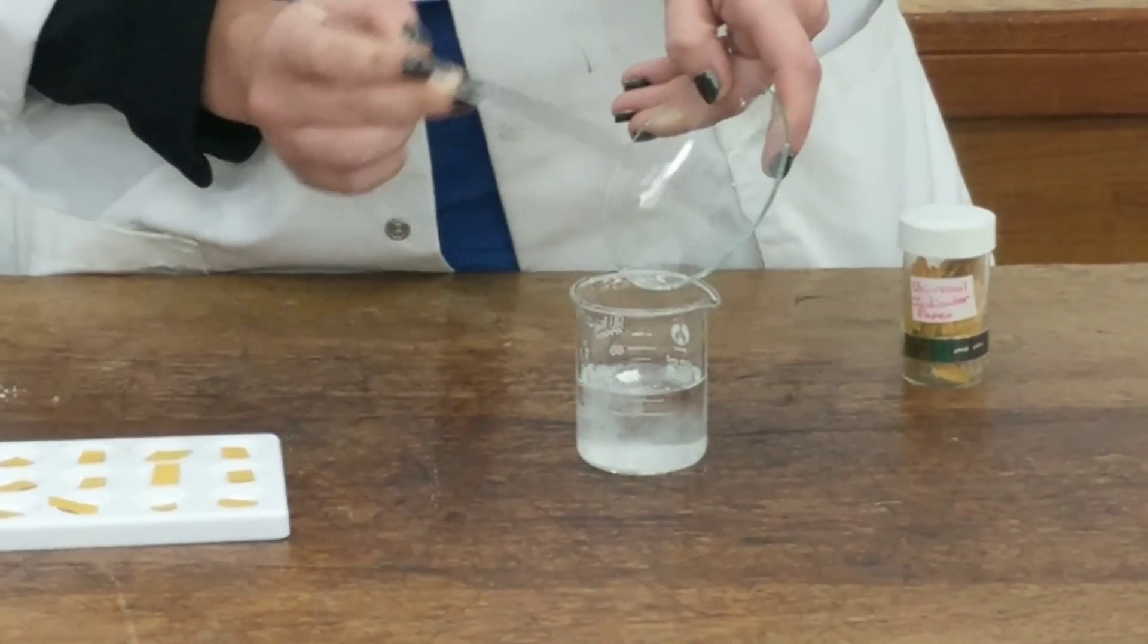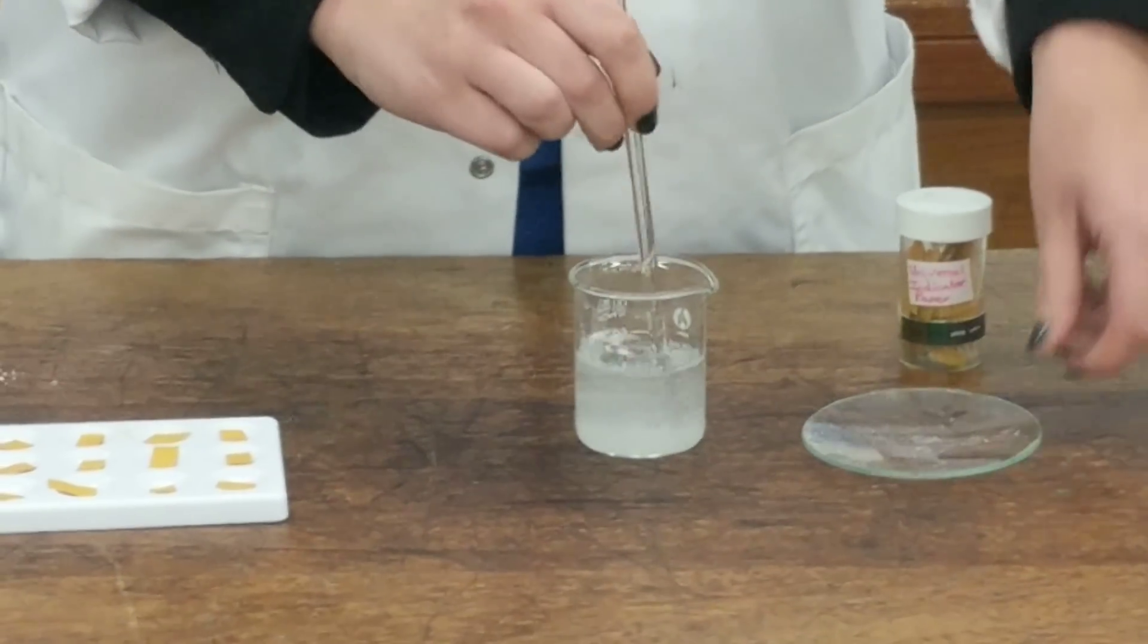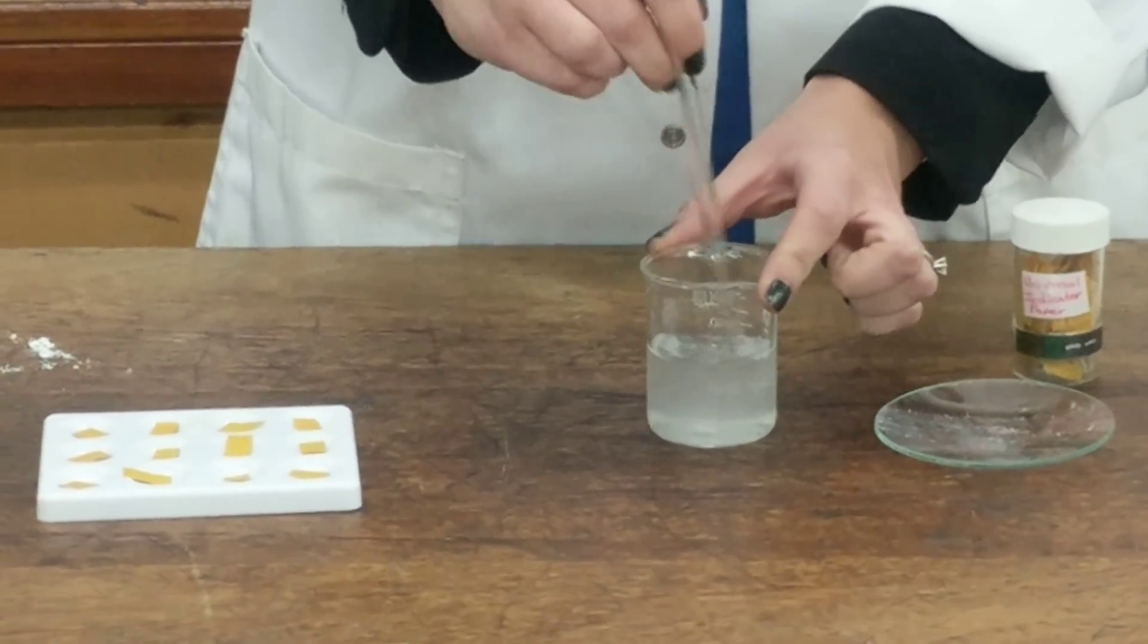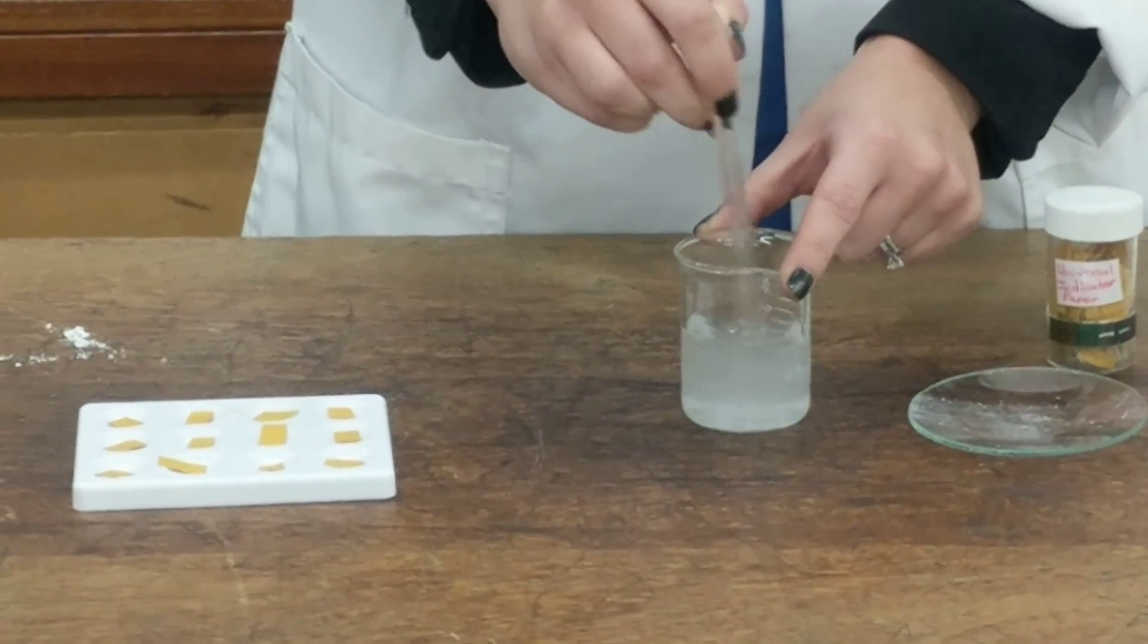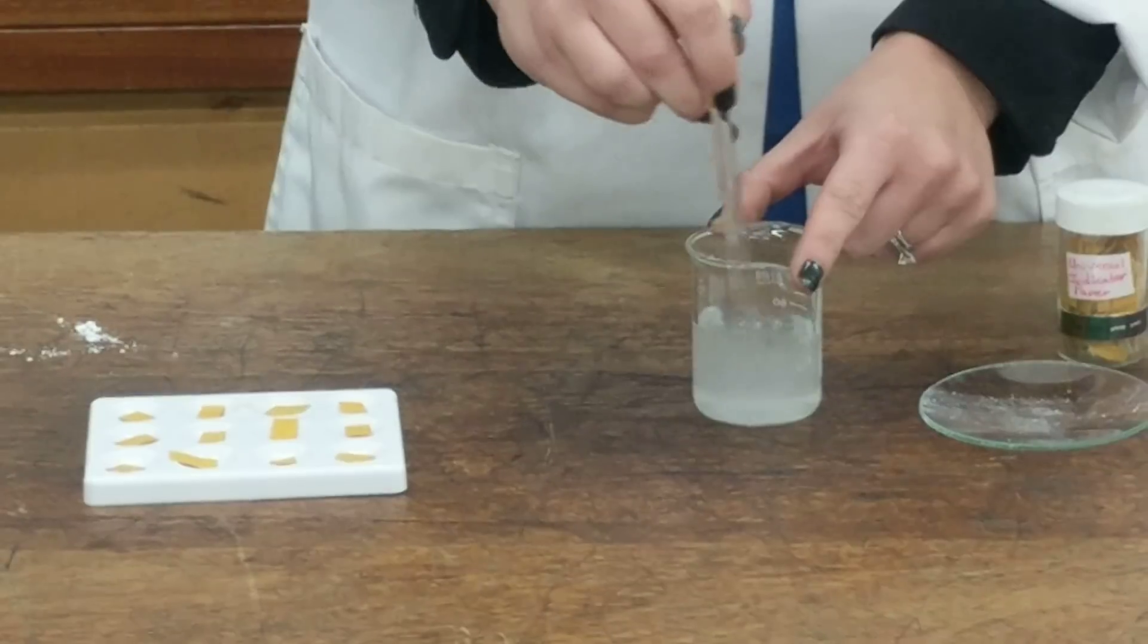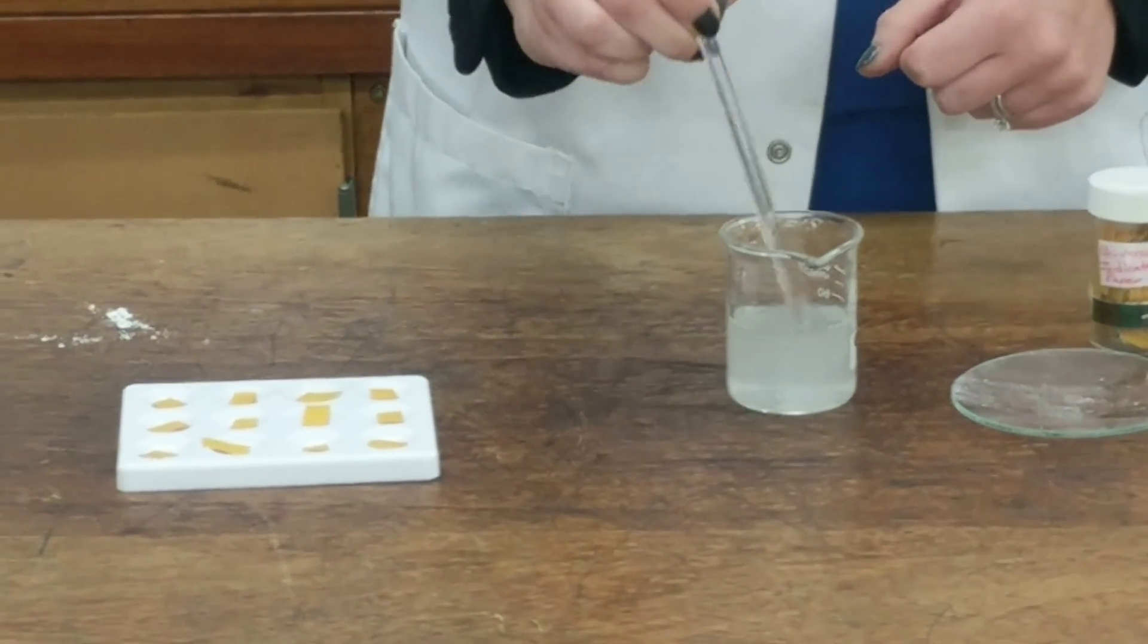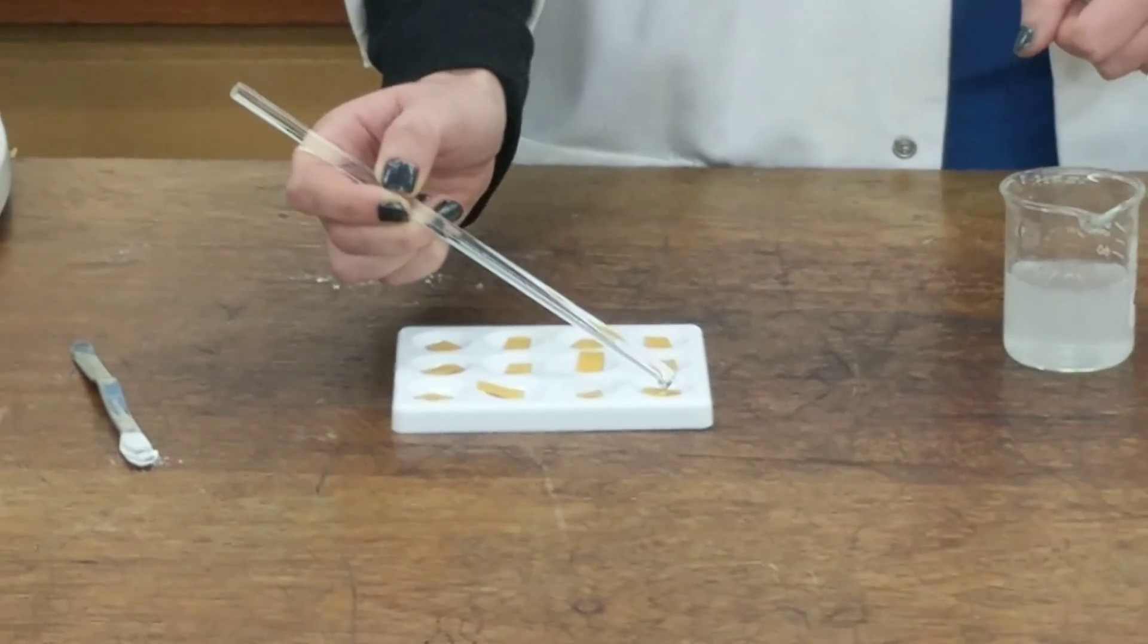Making sure it's all gone in so that the reading is accurate. Put a good stir to ensure it's all reacted. And then you'll take one drop of that onto the first piece of universal indicator paper.